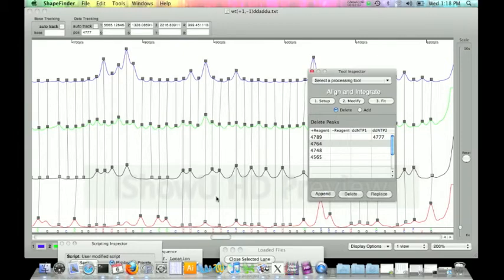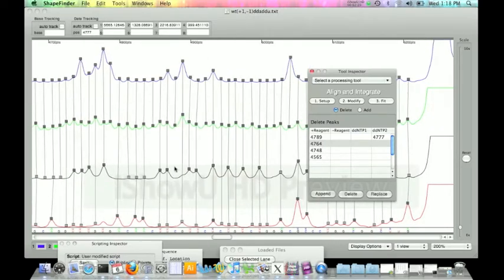So basically what you're doing is you're going through and you're sequencing the data while you're lining it up with the shape peaks themselves. So depending on the number of peaks you have, which is vital because the first nucleotide in the sequence is always going to be the C. Any position number of the sequence is always going to stay tied to the same nucleotide. Makes sense, right? So the number of peaks you tie in here, basically what you're doing is you're telling the computer, hey, there's a nucleotide here, there's a nucleotide here, nucleotide here. So position number 55 is always going to be a G, say.